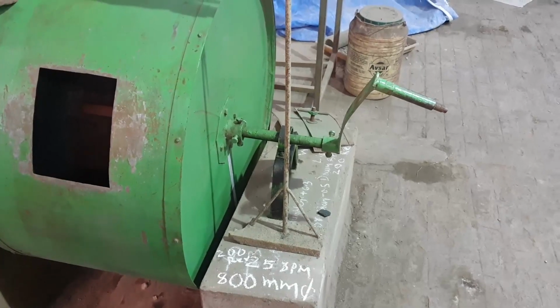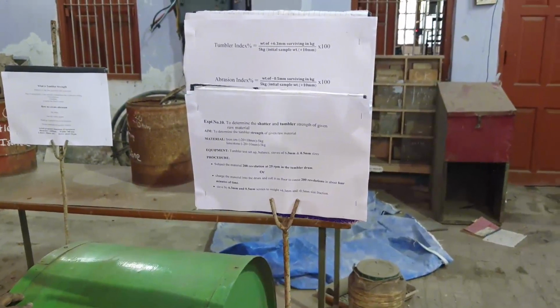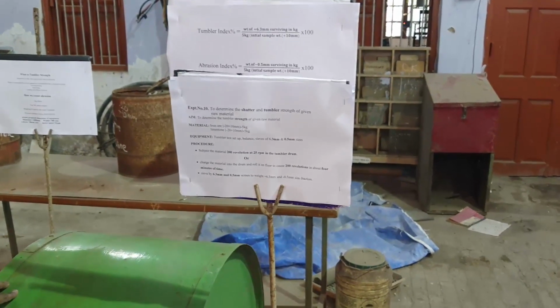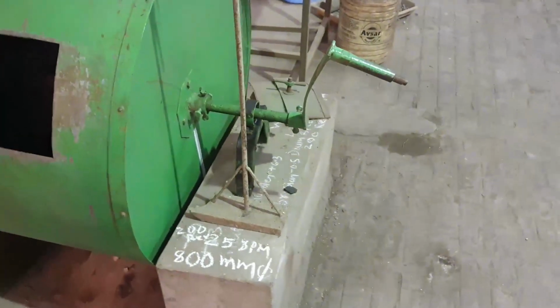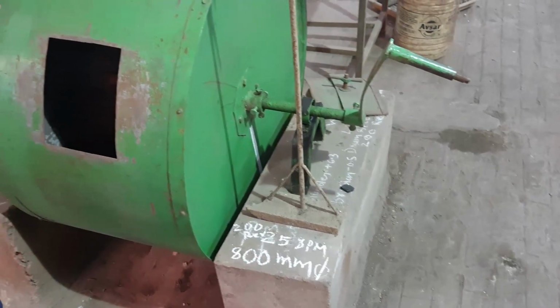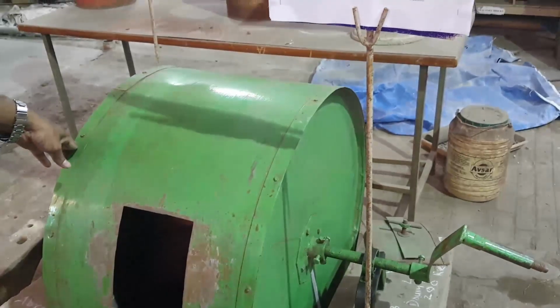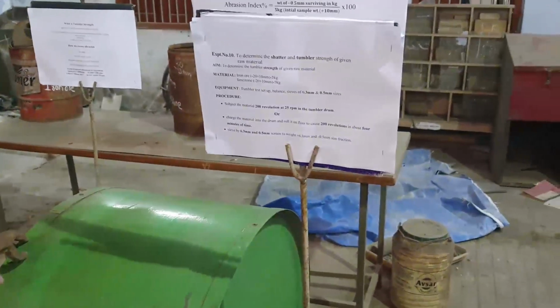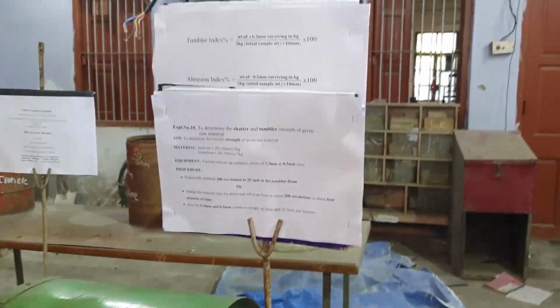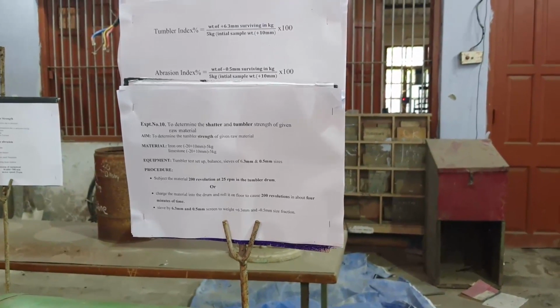Initially we load the minus 20 plus 10 mm raw material, and we subject it to this tumbling action, meaning rotating at the given measurements: 25 rpm we have to maintain, 200 revolutions we have to rotate. And once the material has rotated 200 revolutions at 25 rpm, when it is completed, we will take that material. Then we have to take the two screens.